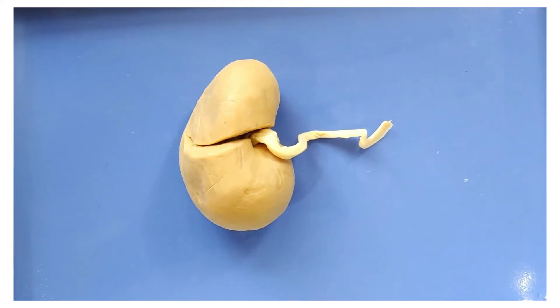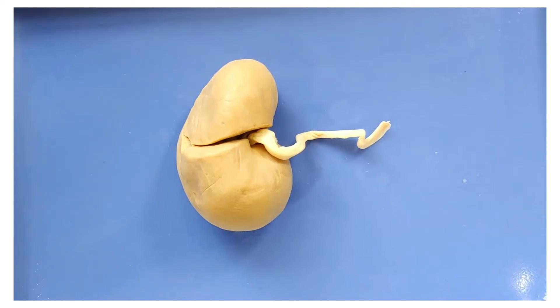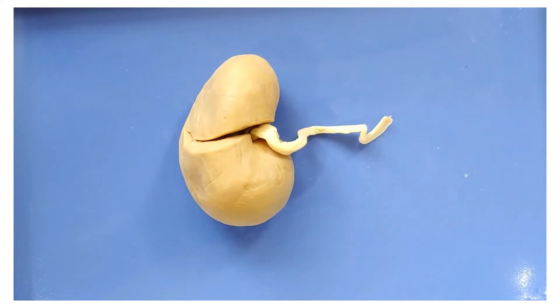So let's take a look at the kidney. Some people describe the average kidney as being as big as a cell phone, which is helpful because it gives you zero information — like, are they talking about a Blackberry or a Samsung Galaxy? I find it more helpful to say that your kidney is roughly the size of your fist.